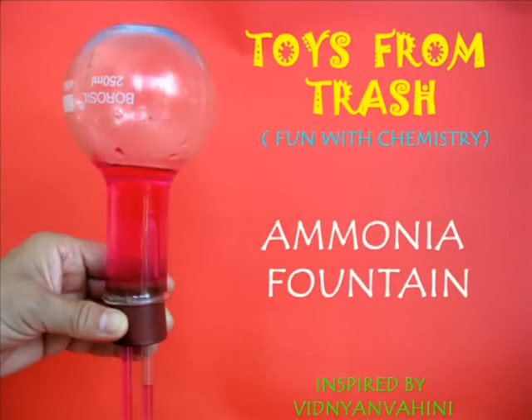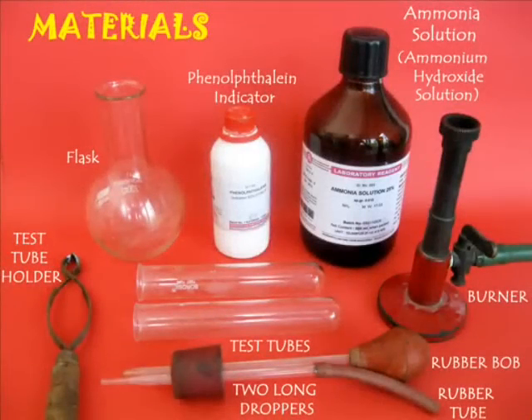To make this ammonia fountain you would require a round bottom flask, a cork with two holes, two droppers, a rubber bulb, ammonia solution, and phenolphthalein.